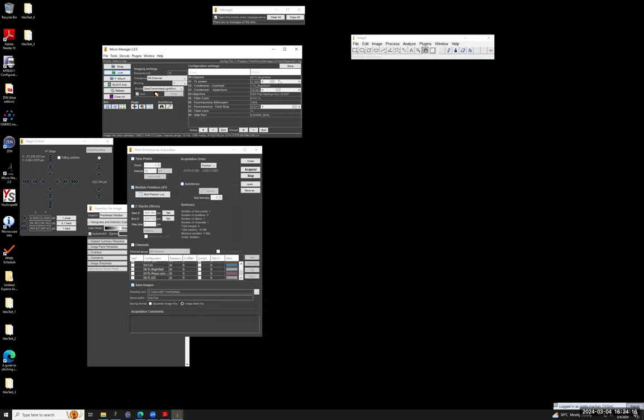And I can show you an example of something that I created, a small BeanShell script to address the fact that I cannot set the condenser aperture in numerical aperture of the condenser. So it is in millimeters, so that's not so intuitive. So let's say I want to set it to be somewhere like 80% of the numerical aperture of the objective for bright field. But then here, I don't know what would be the value in millimeters. So I would have to recalculate every time.